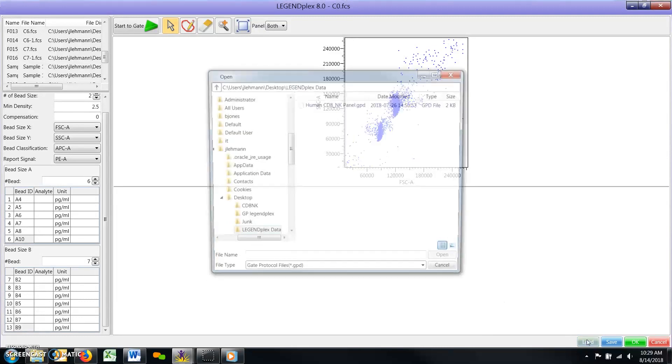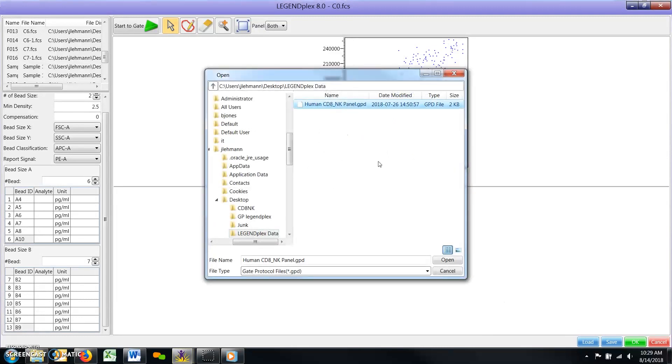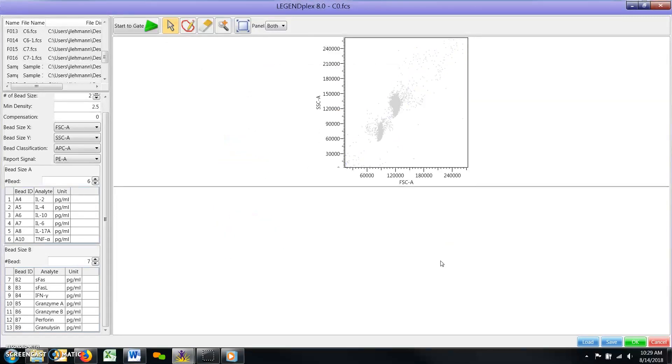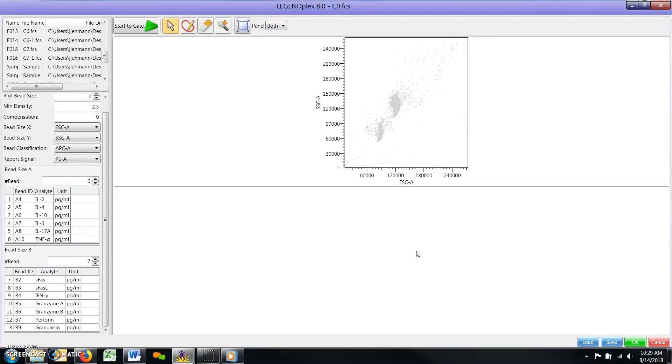Drawing Gates. The purpose of this step is to use one FCS file to draw a set of gates that correctly identifies all relevant bead populations. These gates will then be automatically applied to all other FCS files and can be thought of as a global set of parameters which can later be adjusted for individual files if necessary.